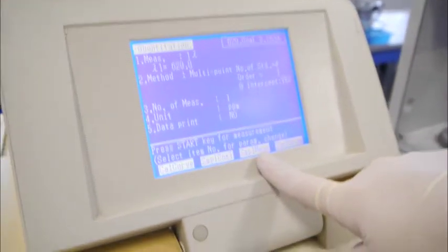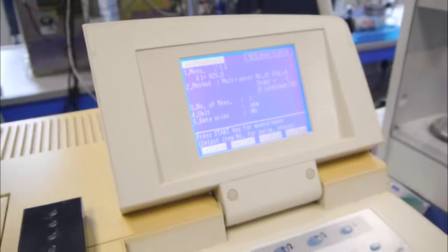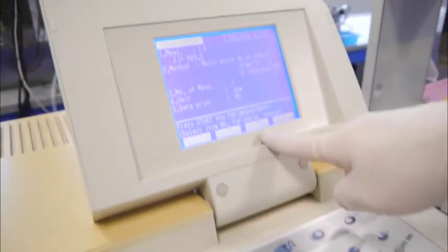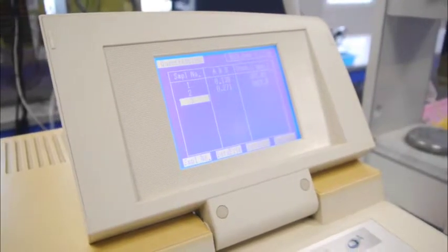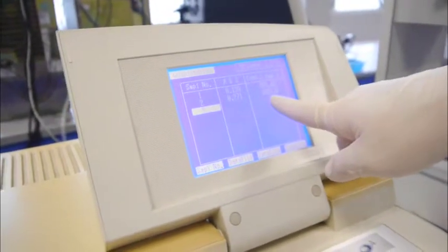Now, to measure our unknown, we will press F3 for sample measurement. So you need to take out the standards, wipe the cuvette, slot in the unknown, and cover. Press F3 for sample measurement and then press start. The reading will be captured for your unknown, and the concentration will be stated there with reference to your calibration curve.